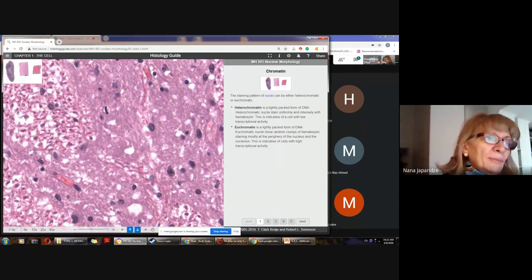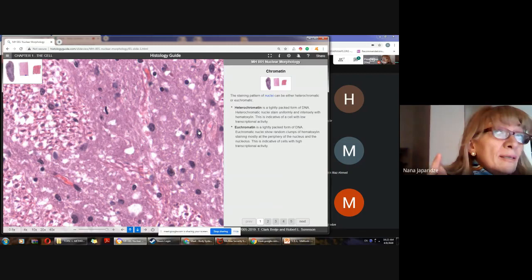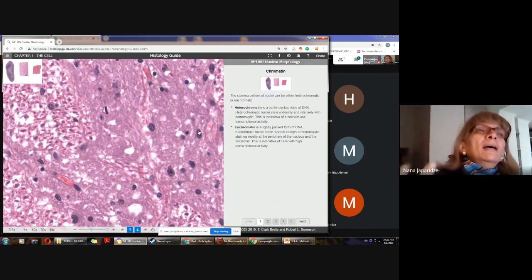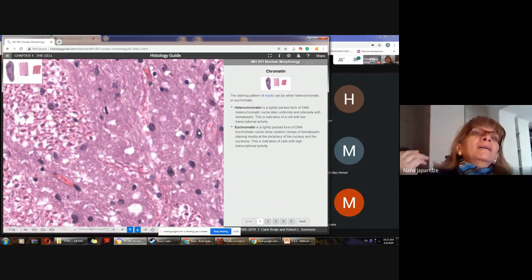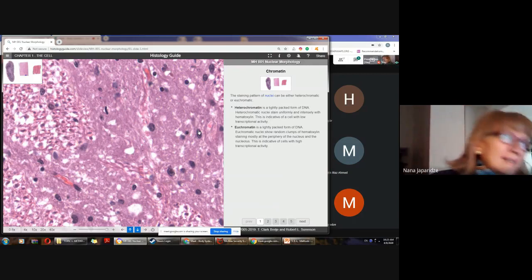And when we are able to identify nucleus, then first what we have to do when we look at the tissue sample and we have to identify type of cell, we have to know its morphological features, size approximately, shape, how they are shaped, and what shape of nucleus they have, is the cell usually active or less active.